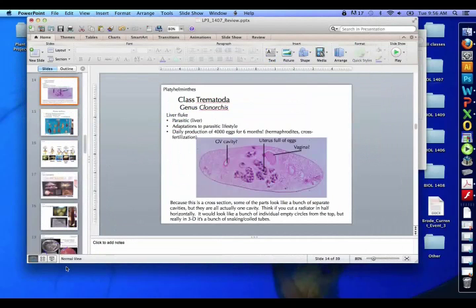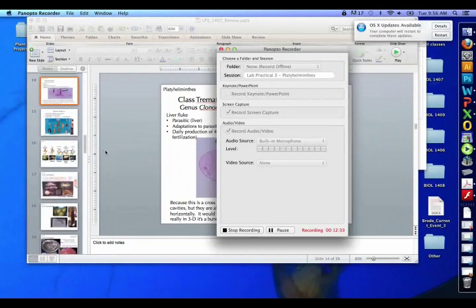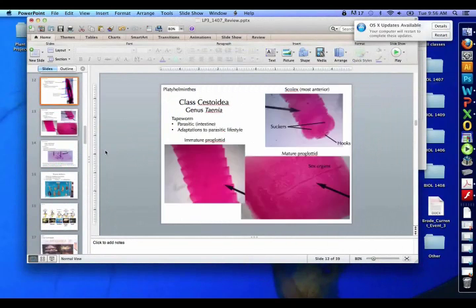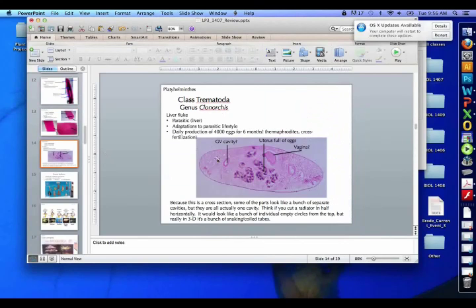That's what I have for flatworms. There are three classes — who's in each class, basic body parts — the more complicated ones for the Planaria and Turbellaria, but pretty much hooks, suckers, and proglottid sex organs for the tapeworm. And there are also a lot of reproductive structures inside the fluke as well.